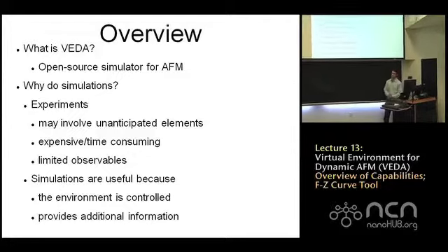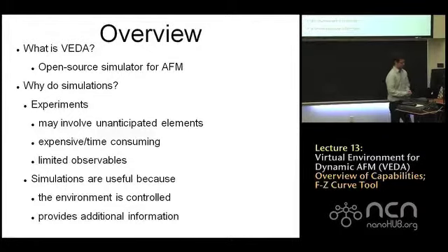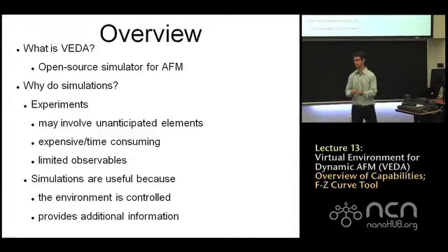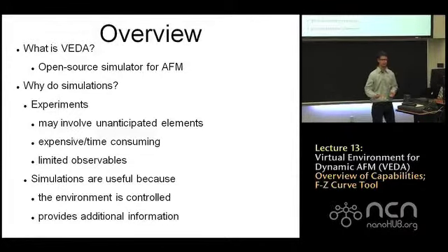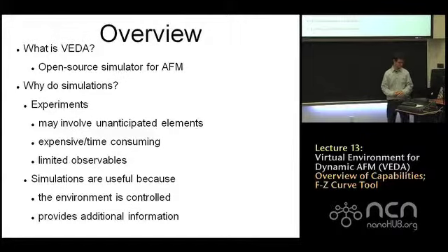The second thing I'd like to discuss briefly before we get started is why do we want to do simulations in AFM? And I thought of a few reasons I wrote down. We can always do the experiment, but some of the issues with the experiment are that it may involve unanticipated elements. So for instance, we think our sample is a hard substrate, like mica or graphite, but actually there's some condensate that forms, there's a liquid layer that forms on the substrate, which affects our results that we don't know about. Or for instance, we attempt to do a force distance curve, but when we apply the voltage to the piezo, there's some creep in the piezo. So there's always these unanticipated elements in the experiment, which can give us headaches, and it's nice to do simulations for that reason. Also, the experiments have limited observables.